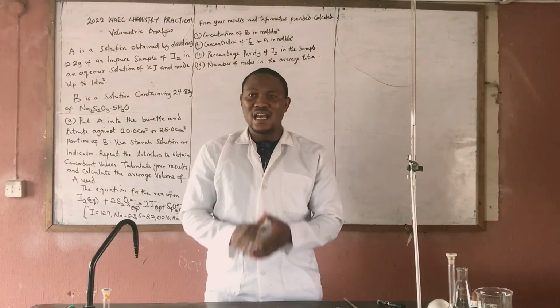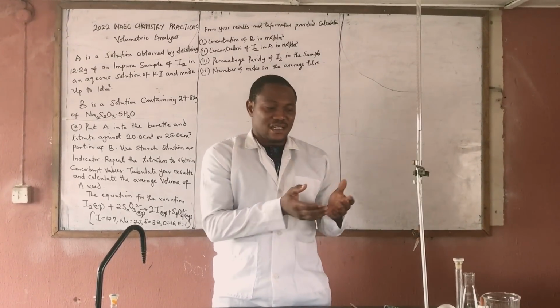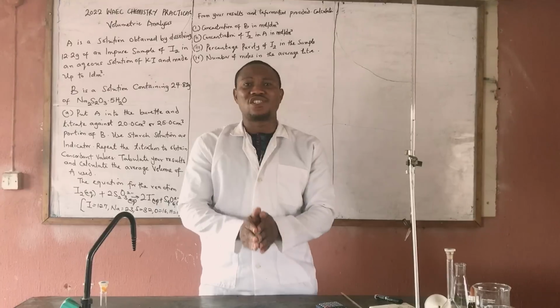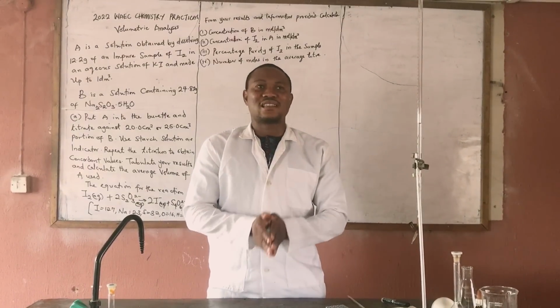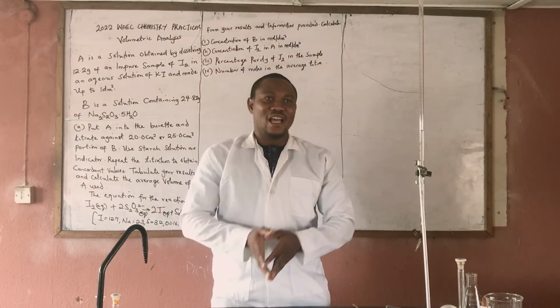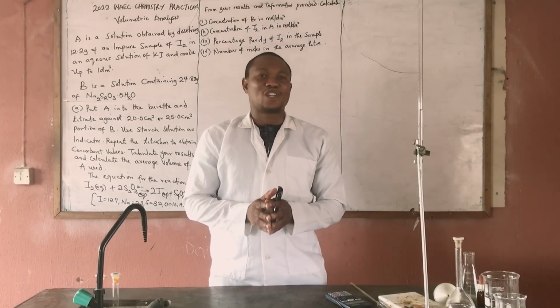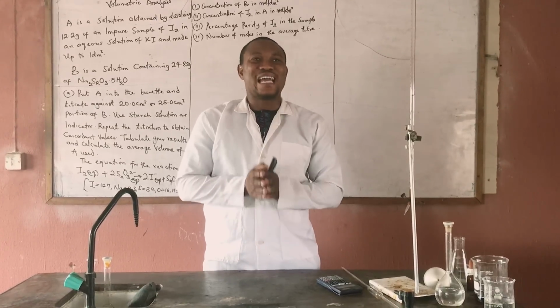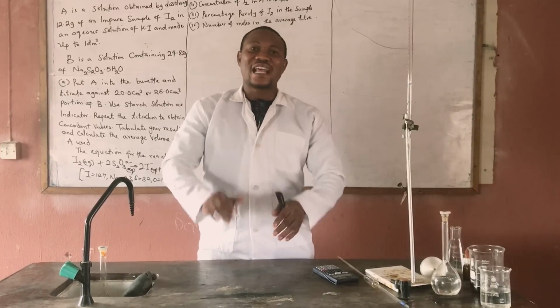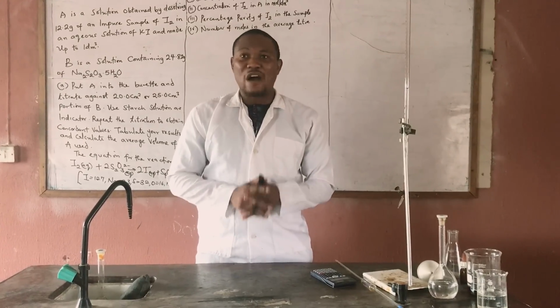So welcome once again. Now, let me quickly start by giving some information regarding the preparation to my fellow chemistry teachers. A lot of people have reached out to me regarding the iodine not dissolving in the potassium iodide, a whole lot of problems encountered when they were preparing it. But you don't need to bother yourself, because if you have adhered strictly to the instructions, there is nothing to worry about. WAEC examiners that gave us the instructions actually know what they are doing. We don't want to assume that they don't know what they are doing. That would be very wrong on our part.